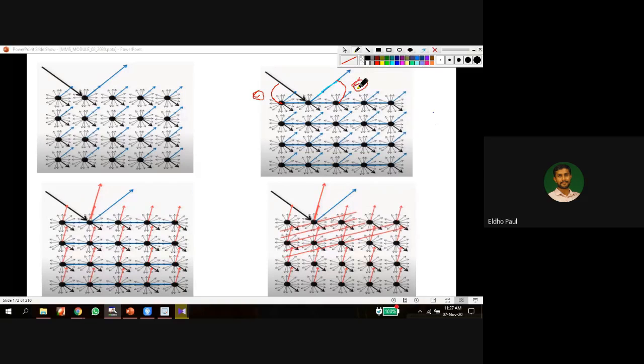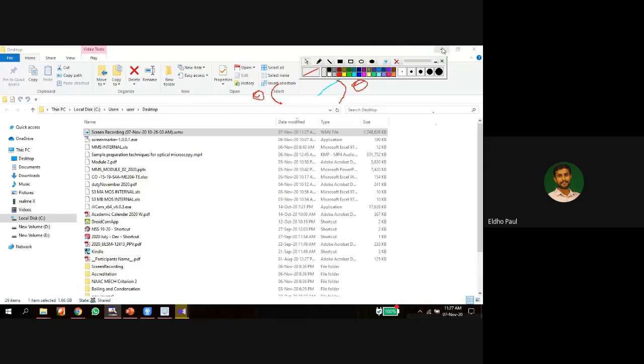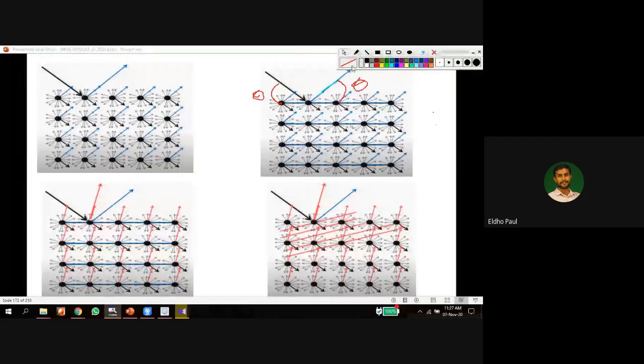The diffracted beam and this plane also make an angle theta. So we can say this diffraction is also a reflection, because this angle is the same. The incident beam and the plane make an angle theta. The diffracted beam and this plane make the same angle theta. So this theta and this theta are the same. We can say this is a reflection.